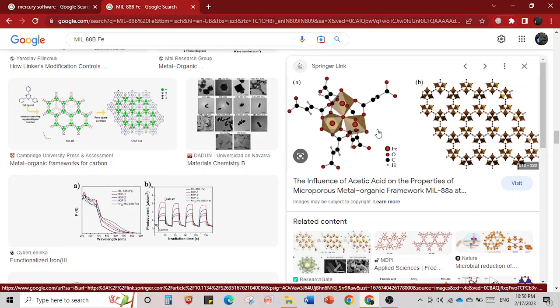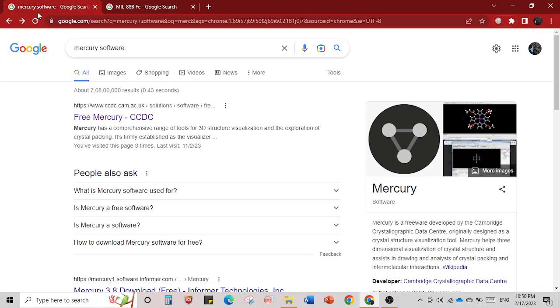To do this there are just two important things needed: one is the Mercury software, and the second is the CIF file. I will tell you how to download the Mercury software. Mercury is a freeware, meaning it is available for free, and it is developed by the Cambridge Crystallographic Data Centre, in short called CCDC. It is originally designed to view crystal structures with visualization tools.